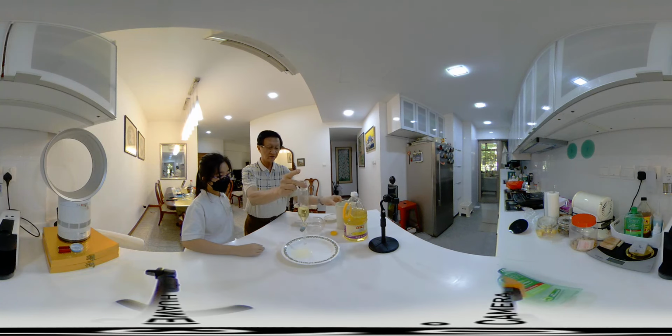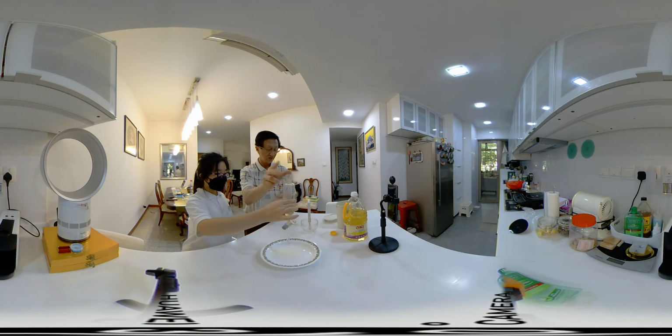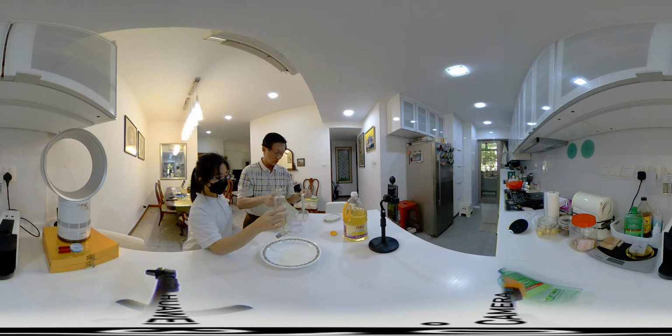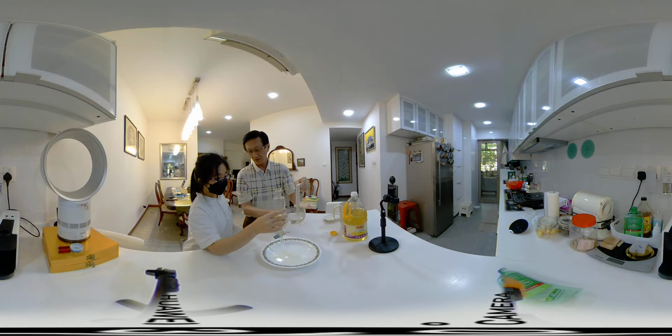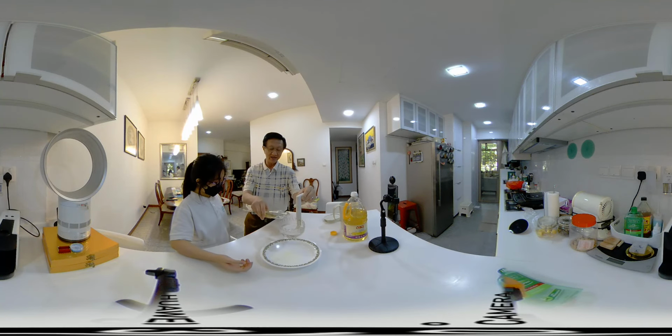Now this separating funnel is also used by housewives to separate the oil from the soup. Let's say this is the soup. Then people are very scared about the oil, so they don't want the oil, right?